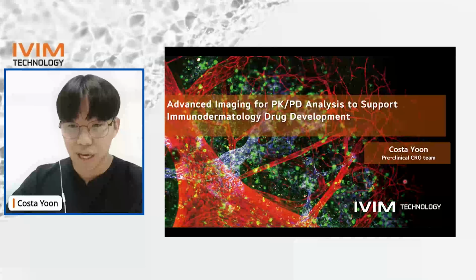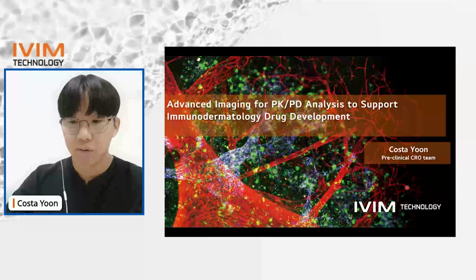Specifically, I will present our research on PK/PD analysis in mouse models of psoriasis, atopic dermatitis, and hair follicle imaging for alopecia drug development. And lastly, wound healing studies enabled by intravital imaging.